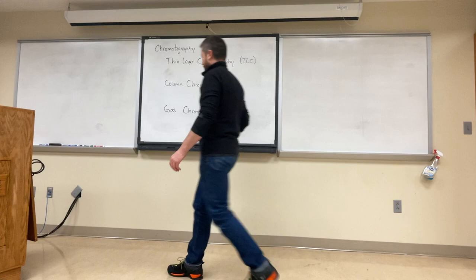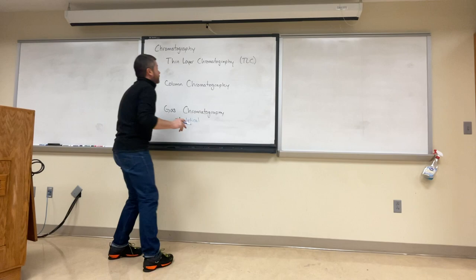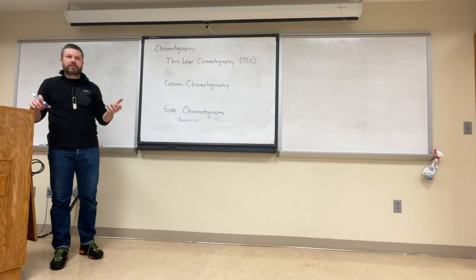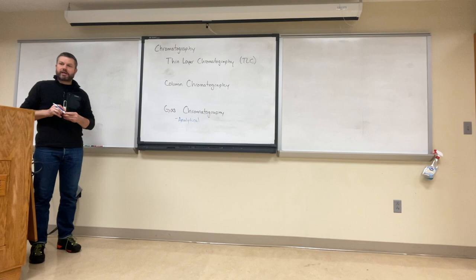Gas chromatography we describe as being an analytical method. We're using it just for analysis; we're not expecting to recover anything that we put onto the GC. Anything we inject into that column, we assume in order for it to be detected, is going to be destroyed. That's kind of nice, because usually with GCs we only need to inject micrograms of material onto the column in order for any detection to take place, so we don't have to waste much of our sample.